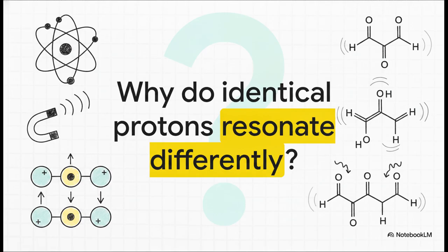If every single hydrogen proton is physically identical, and every proton flips exactly the same way in a magnetic field, shouldn't they all just absorb the exact same frequency? And if they do, how in the world does this actually help us identify complex multi-atom molecules?